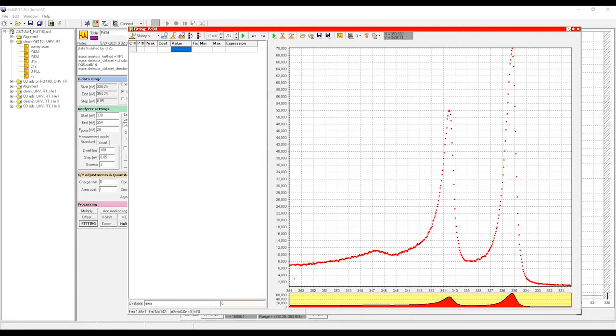So for this, first you need, as Brett said, to cut the background. I guess maybe some of you are familiar with fitting of XPS spectra. You can ask if it actually makes sense to go through those. If everyone is familiar, then of course we would not explain this because this is basics, which people know who work with some XPS machine. So you measure spectra, then you need to process them. You need to fit them to find states, and so on.